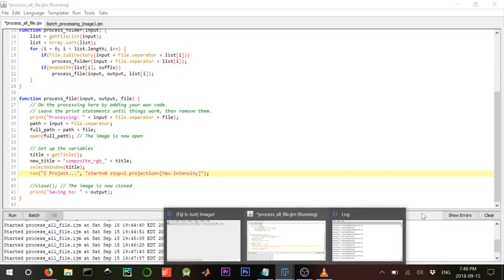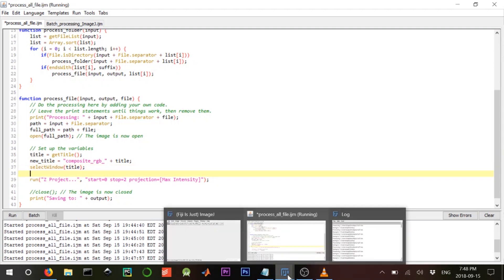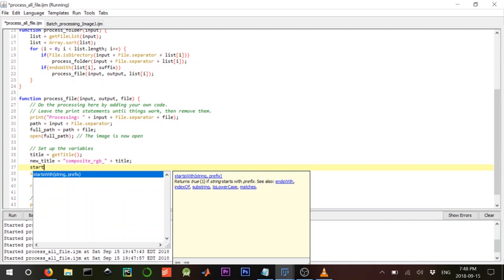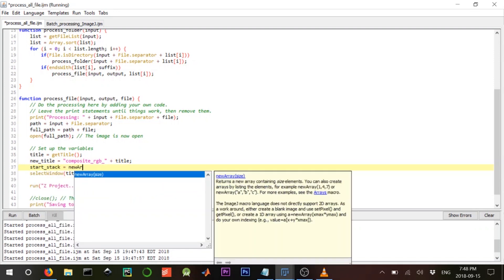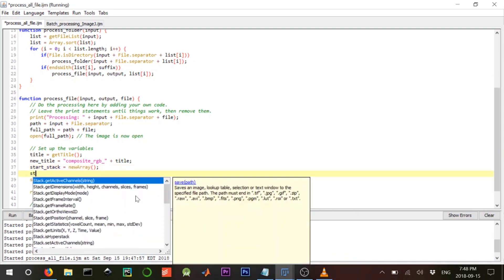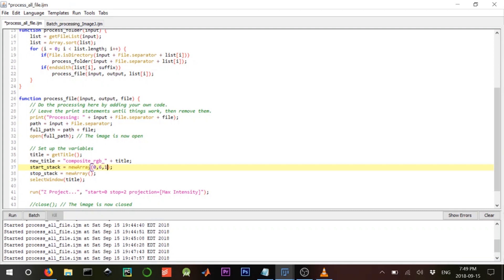Now we know we need to run the same thing for multiple stack brackets. We're going to create a variable: start_stack, which will be a new array. The start_stack array will hold the start values of the three stacks we want: zero, six, and eleven.